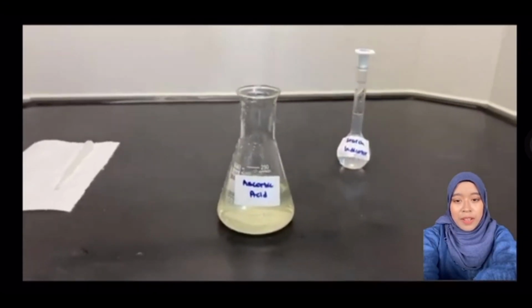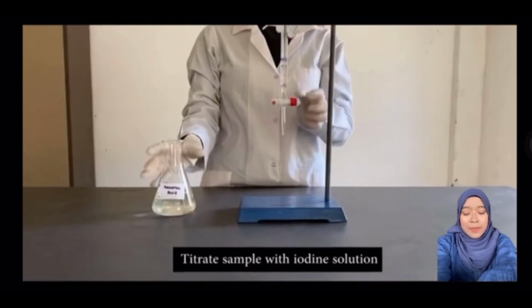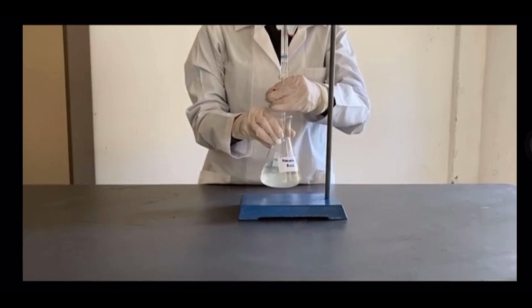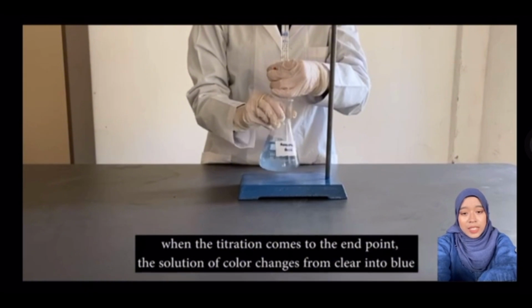Next, we need to fill the burette with 50 ml of iodine solution. Last but not least, titrate the sample with the iodine solution. When the titration comes to the end point, the color of the solution changes from clear to blue.